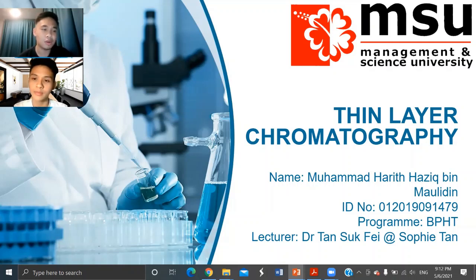Okay, so today, what we're going to learn is a basic topic, which is thin layer chromatography in pharmaceutical analysis.